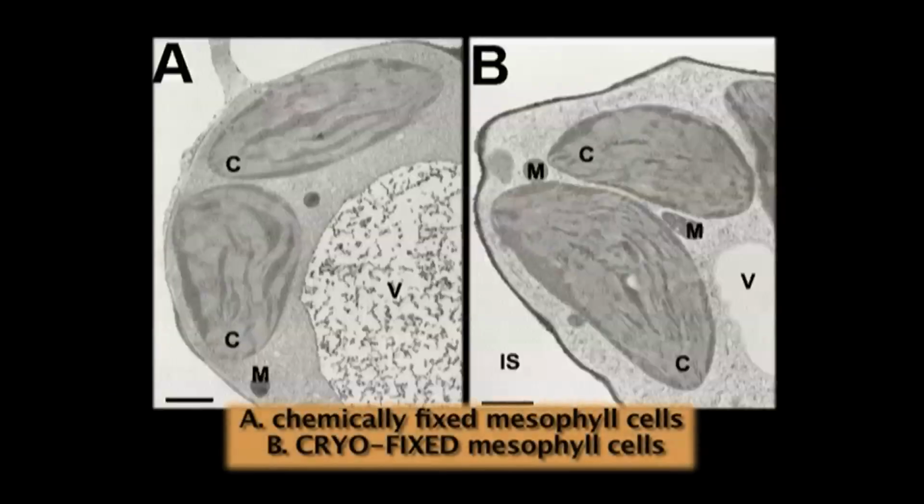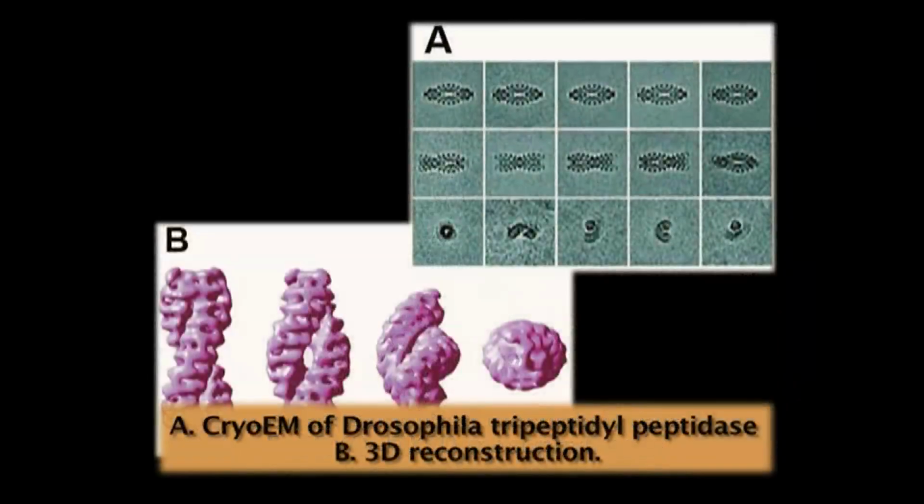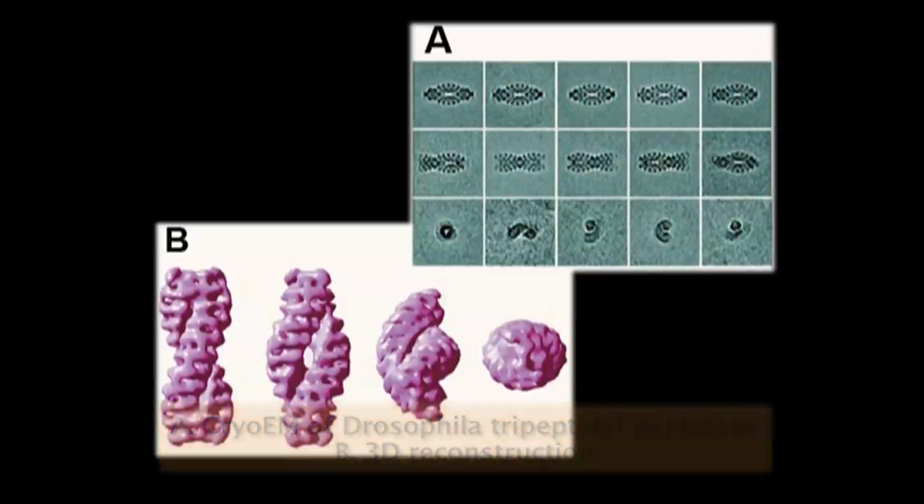Most recently, what people do is cryofixation for cryo-electron microscopy. One of the important advantages of cryo-electron microscopy is that the artifacts which come due to sample preparation in conventional electron microscopy can be removed in most cases, where the samples are plunged in liquid nitrogen.